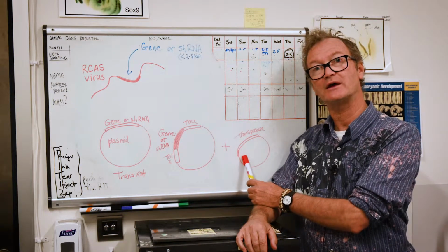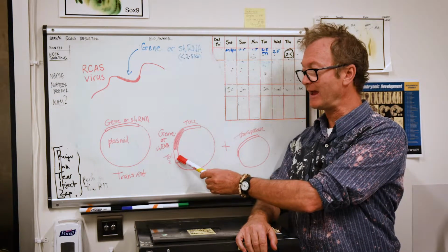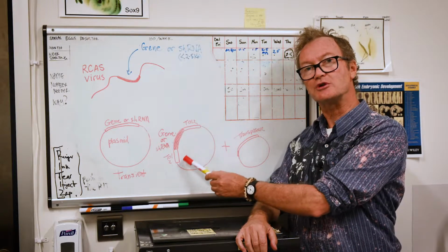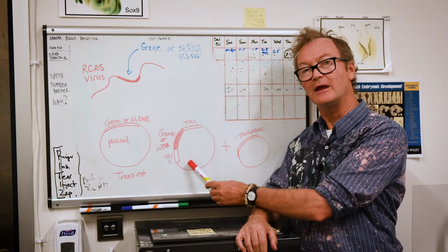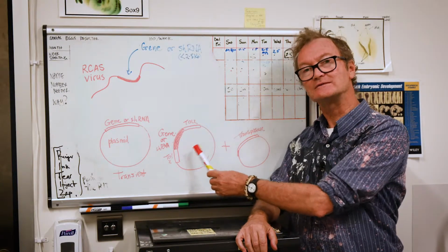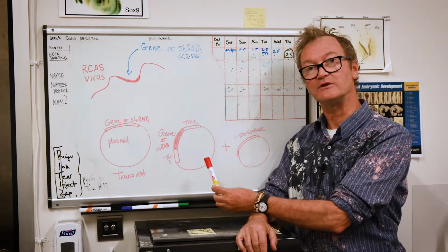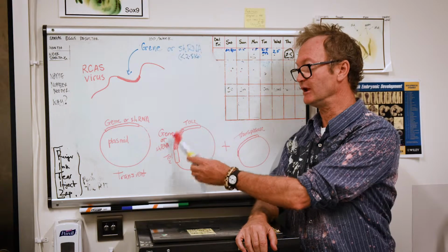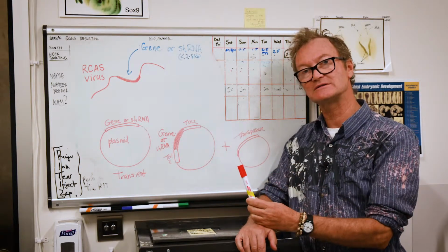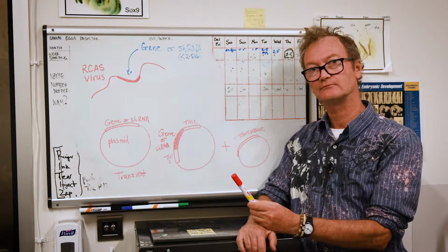The transposase enzyme will take this DNA construct out of the plasmid, and via these Tol2 arms, which have homology to transposable elements in the genome, it can transfer this construct into the genome. This allows a permanent integration of your gene of interest, so that the gene is expressed in cells of interest and in all daughter cells subsequently during cell division.